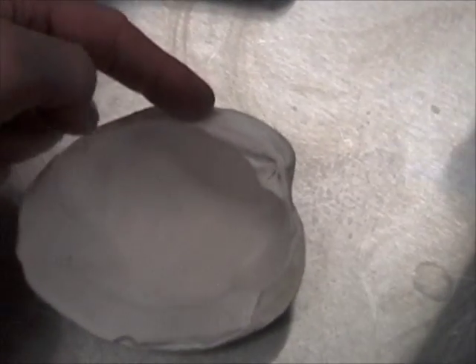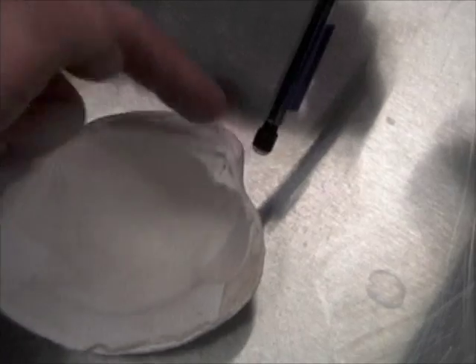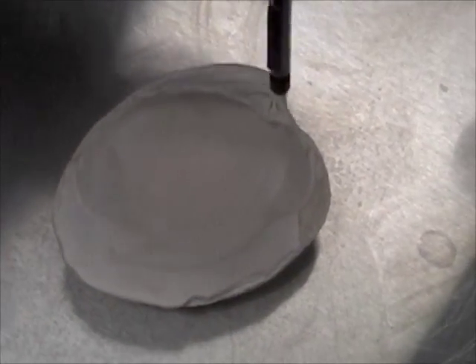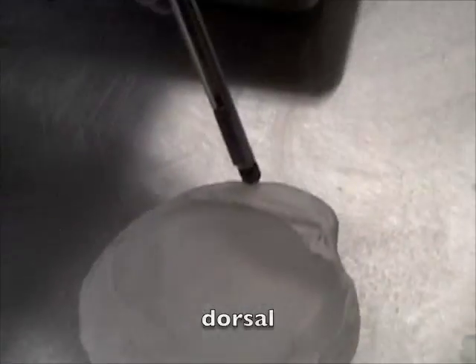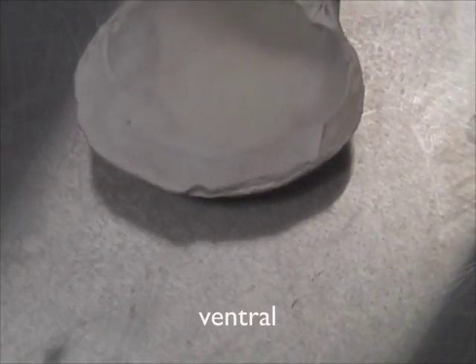The anterior part — yes. The beak is the point right here, same side as the umbo. The anterior is the same side as the beak. So that's the anterior, that's the posterior. Dorsal. Ventral.